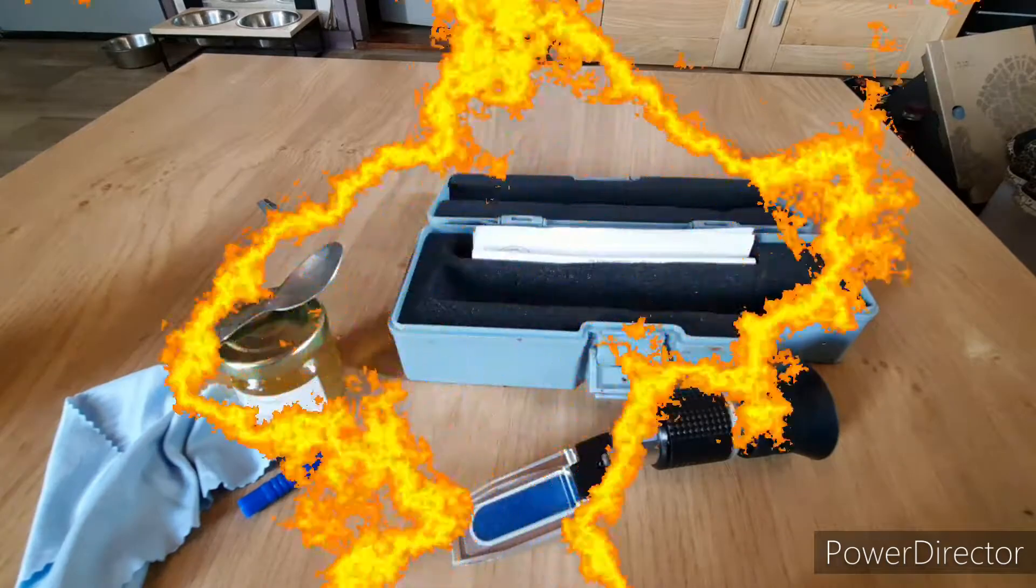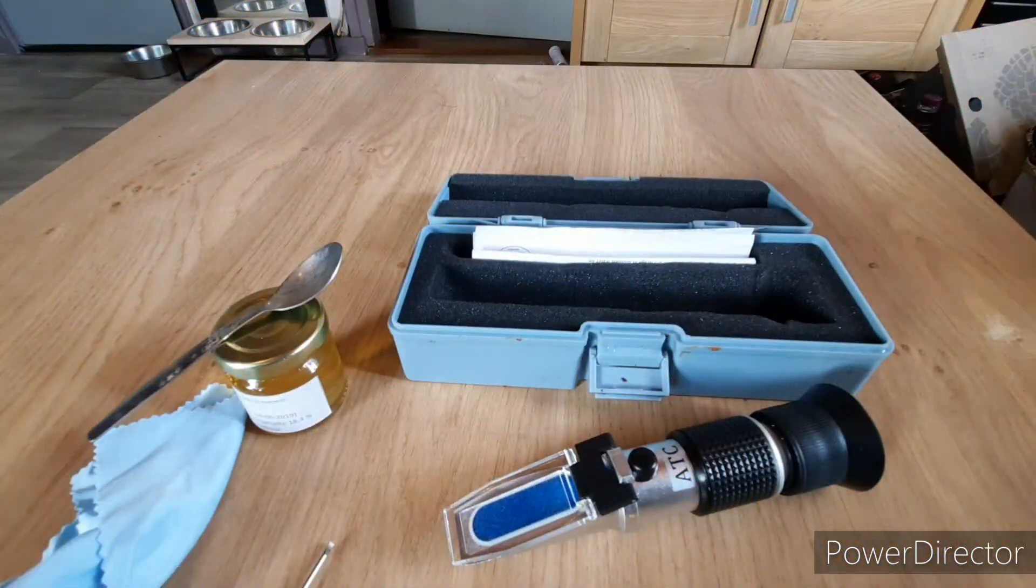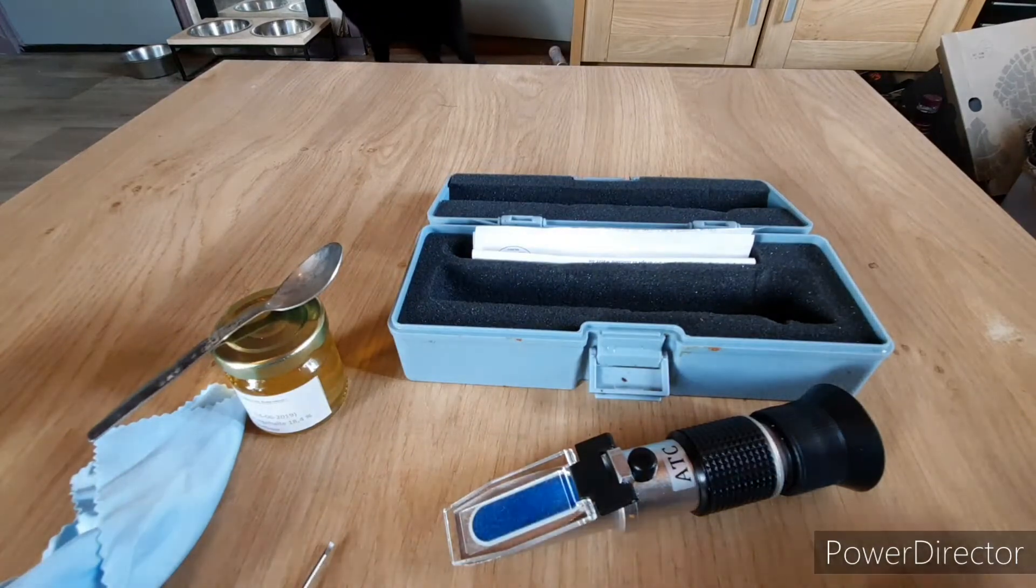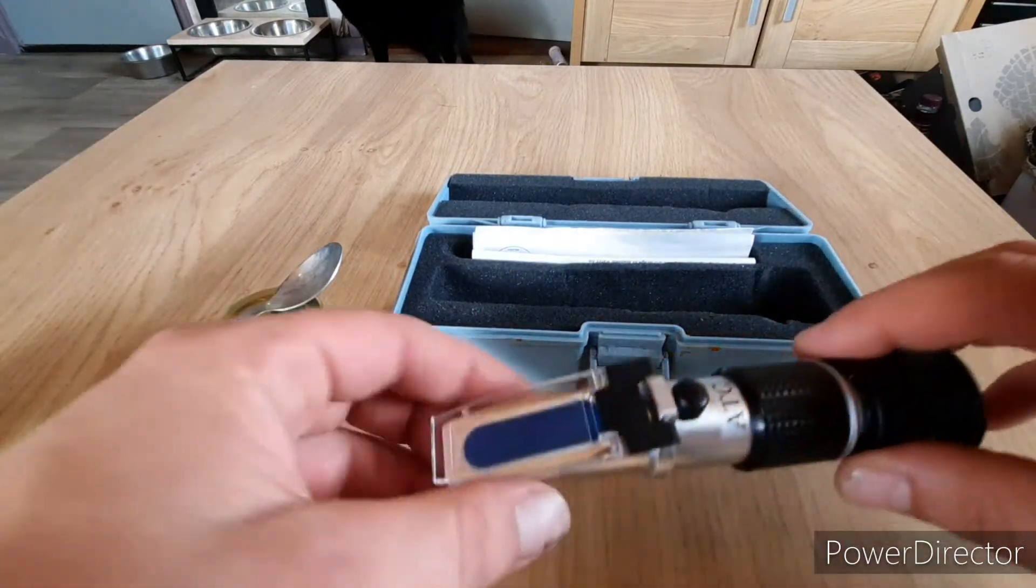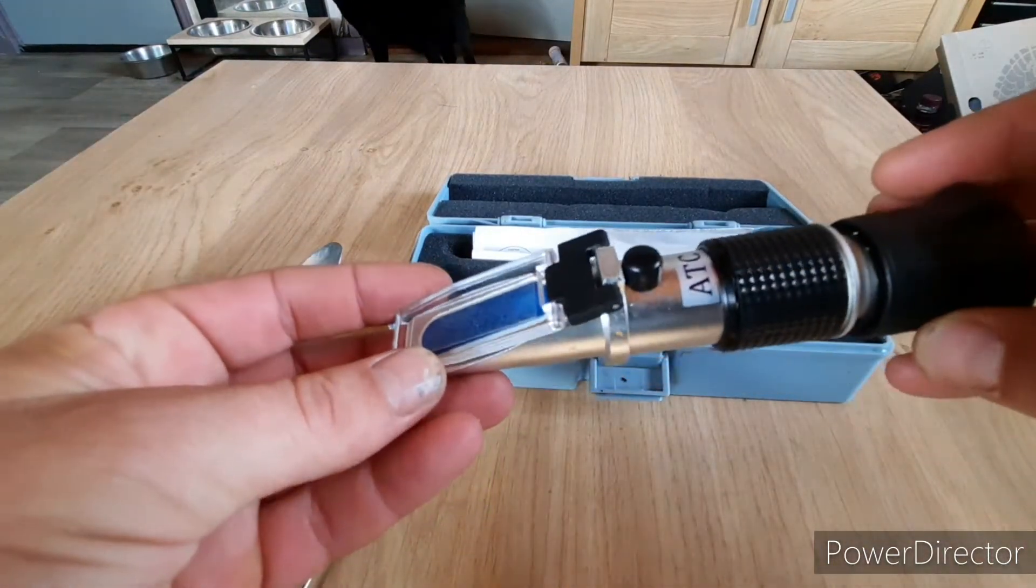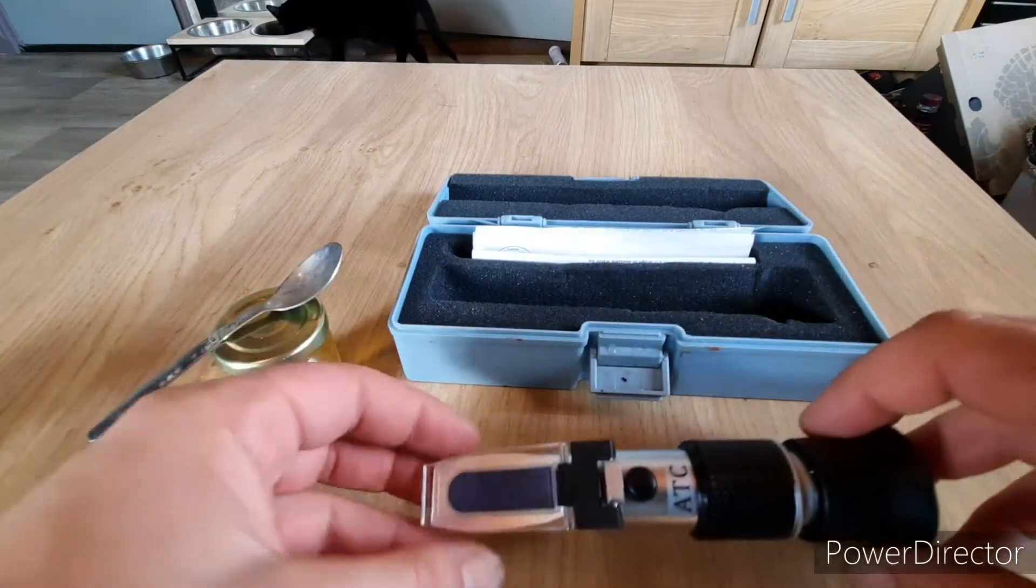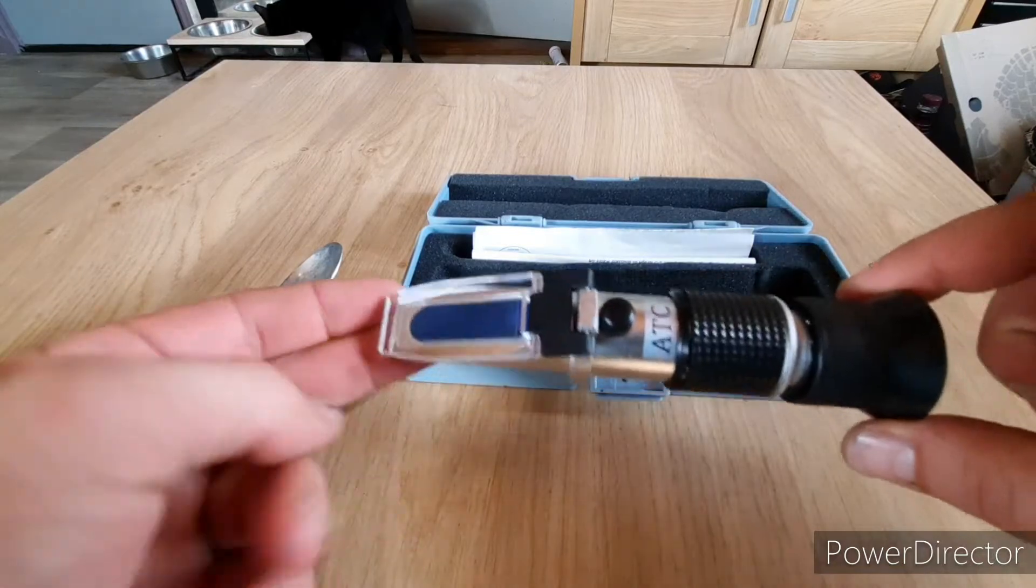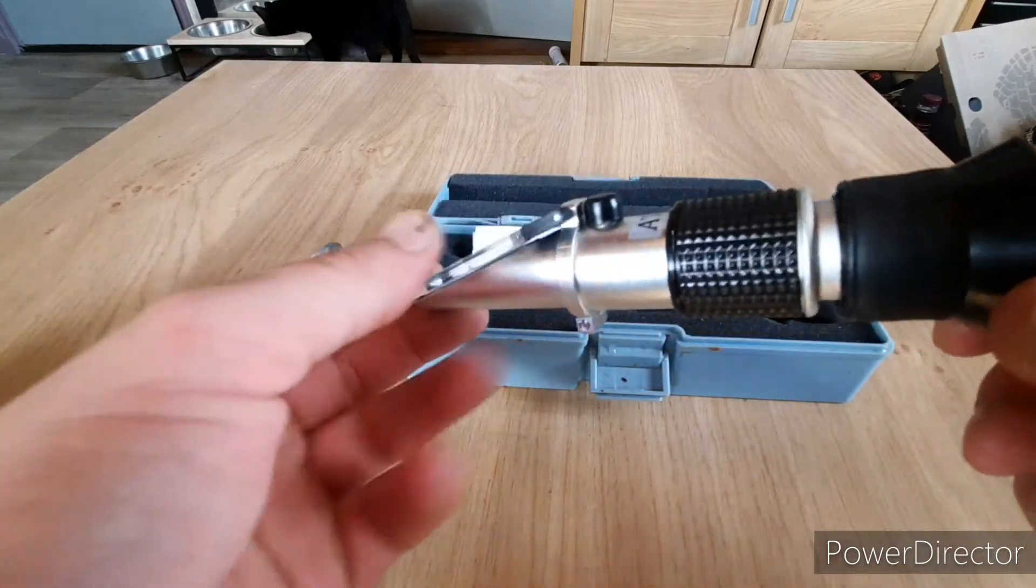Today I'm going to show how to use a refractometer to check the sugar level in honey. What is a refractometer? The refractometer is a little device that measures the index at which the light breaks through the fluid.